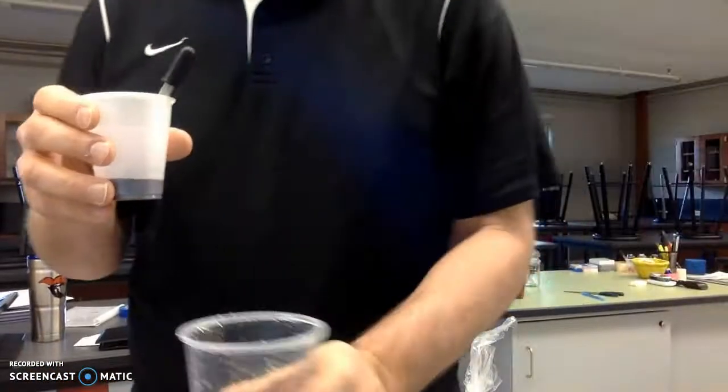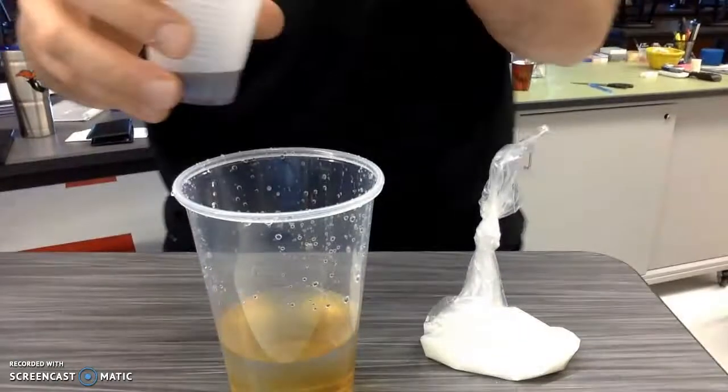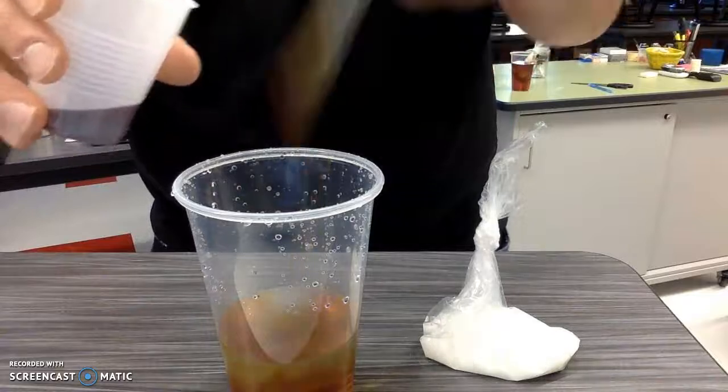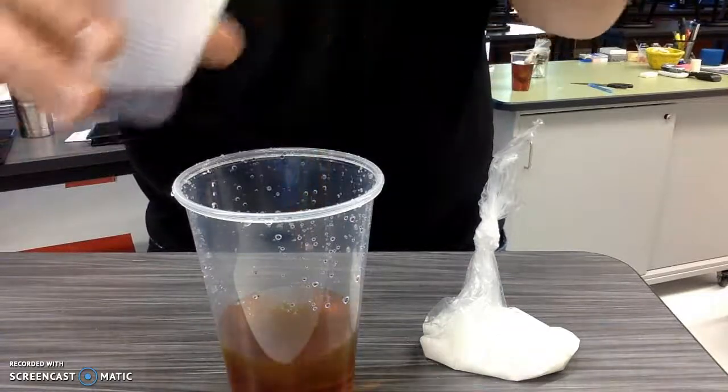The second part of this is I'm going to take another cup, which, let me dump this one. I'm going to take another cup and just put water in it, and then I'm going to take iodine and put it in there, okay? And all I'm doing is putting the drops of iodine. You can even see. I'm just putting, here, let's go like that. There you go. And I'm putting the iodine in, and I'm just going to take a couple of squeezes here of iodine just so it shows it.